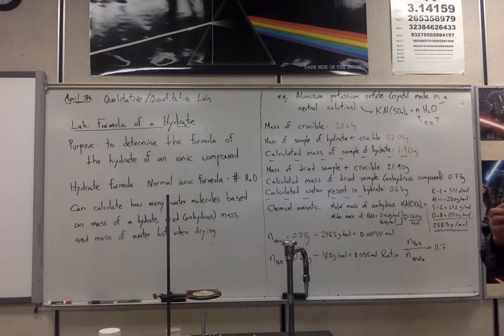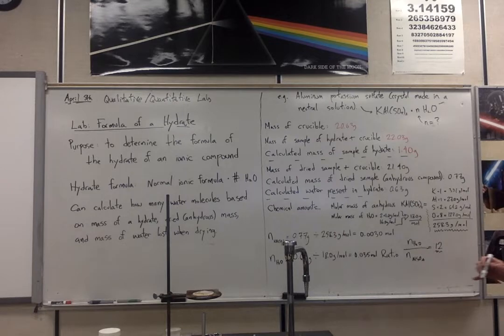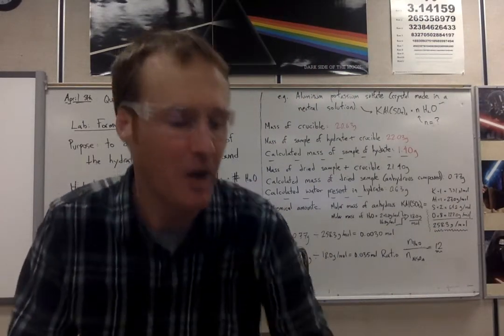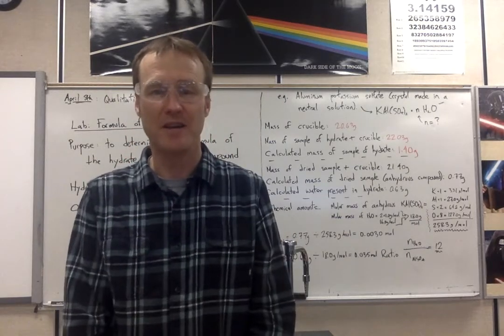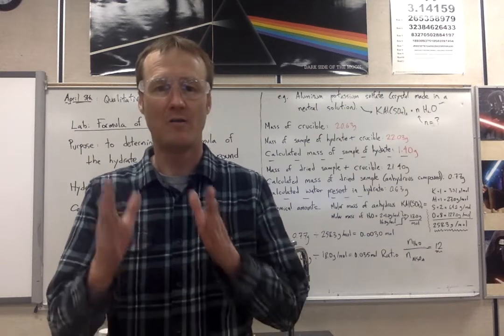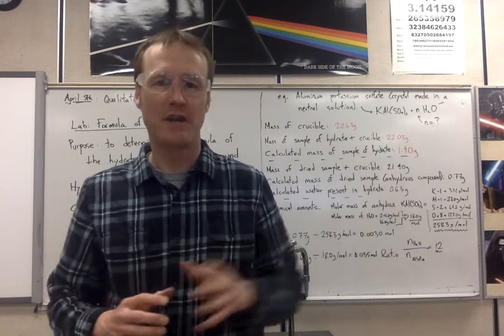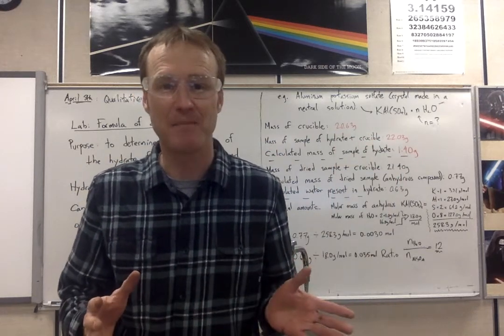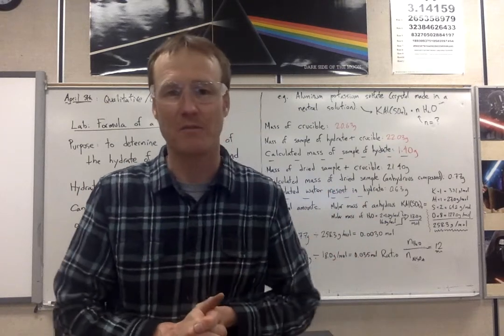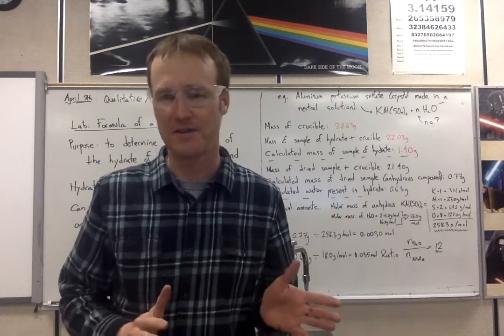We only have 2 significant figures allowed, in fact, so really I should be reporting the result as 12, which actually is really very interesting. It implies that the crystal that I made really did have a formula, just like on the box, of KAl(SO4)2·12H2O. I thought I made something with 8, but that's totally fine. According to this, it's 12. You got to go with what the data tells you, not your own pie-in-the-sky ideas.